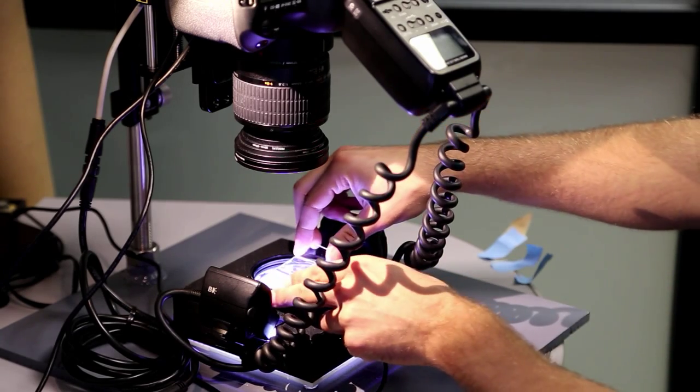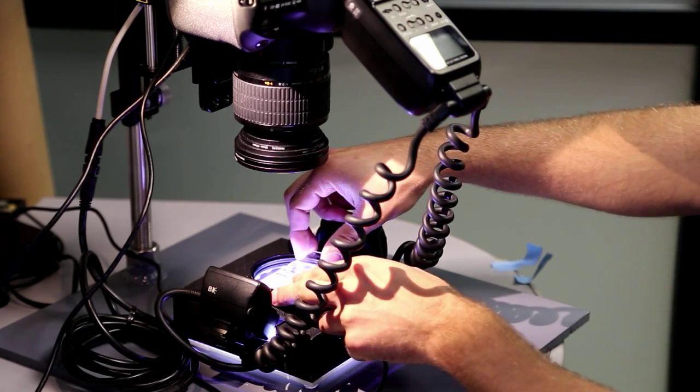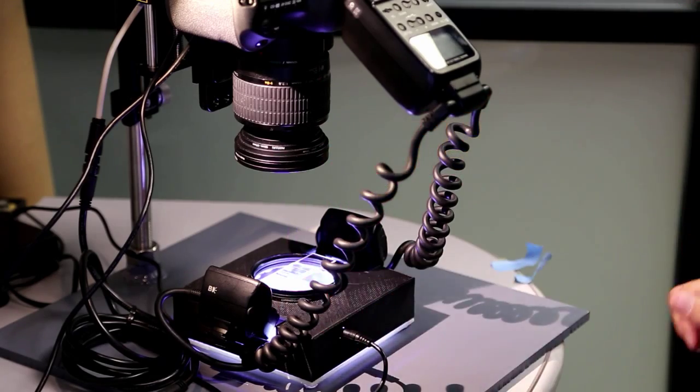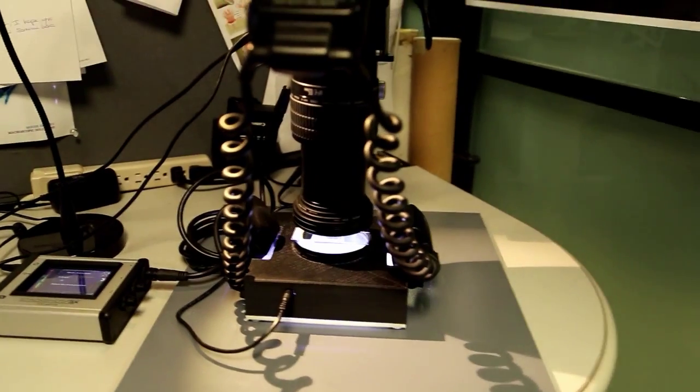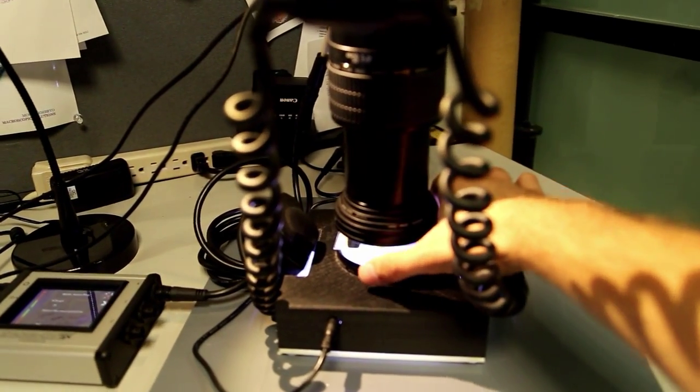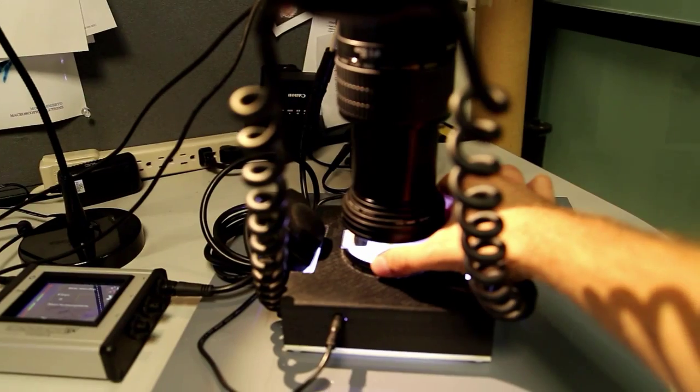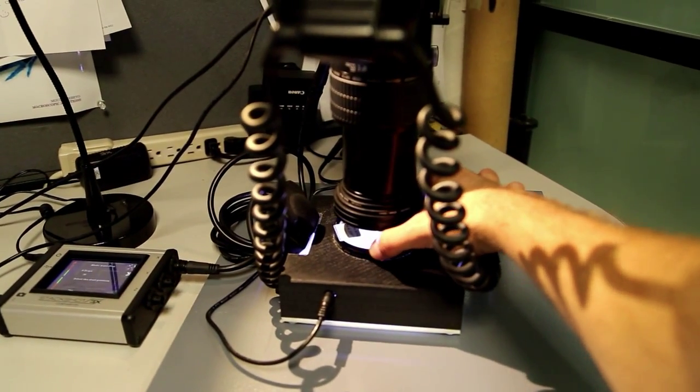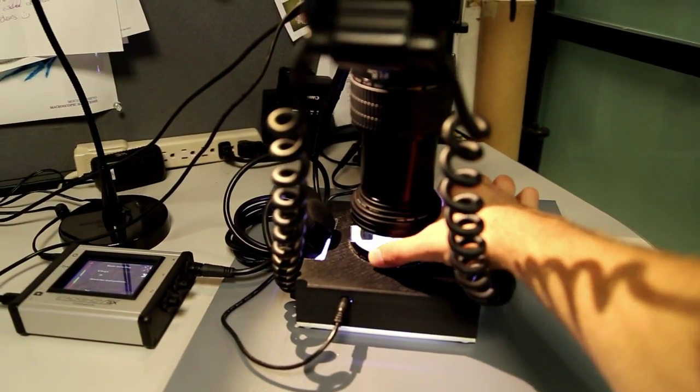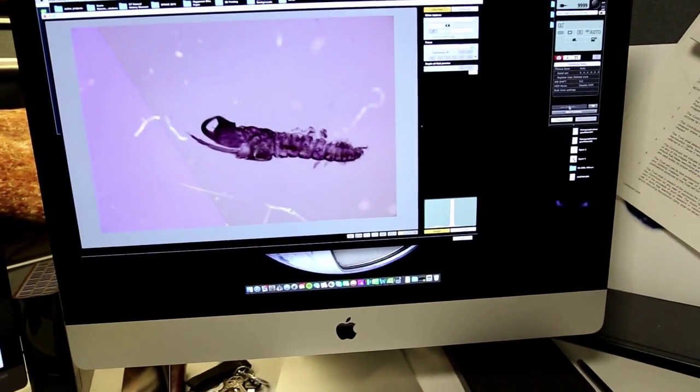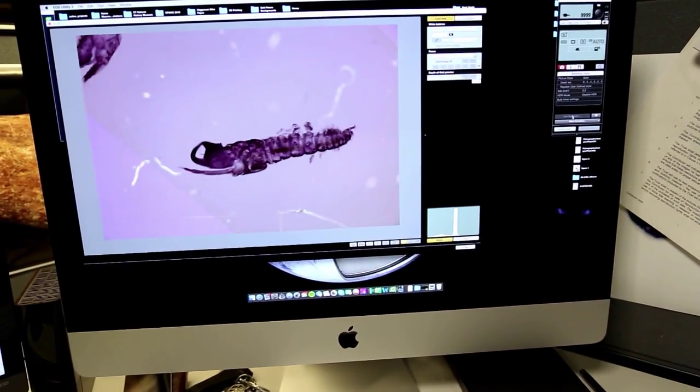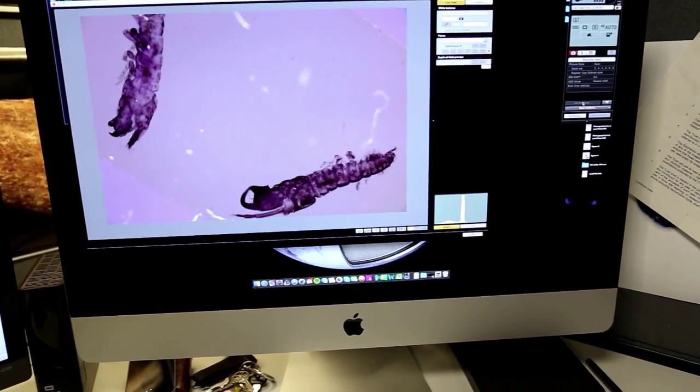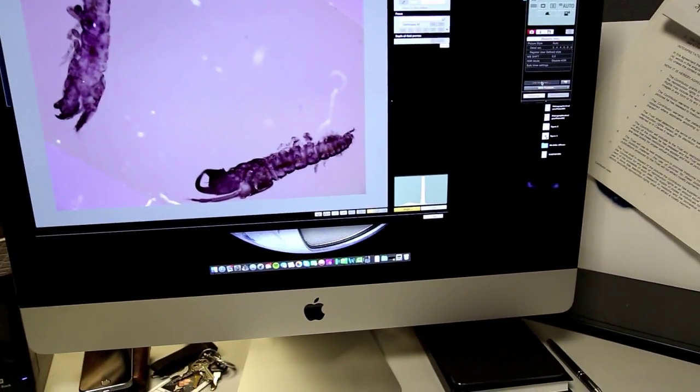And I'll be able to look at anything from biological tissues, from genitalia, from other things like that, the same way I would in a microscope. So this box, you can really place this directly underneath your standard dissecting scope, and you'll be able to see some pretty clear information just from using this.